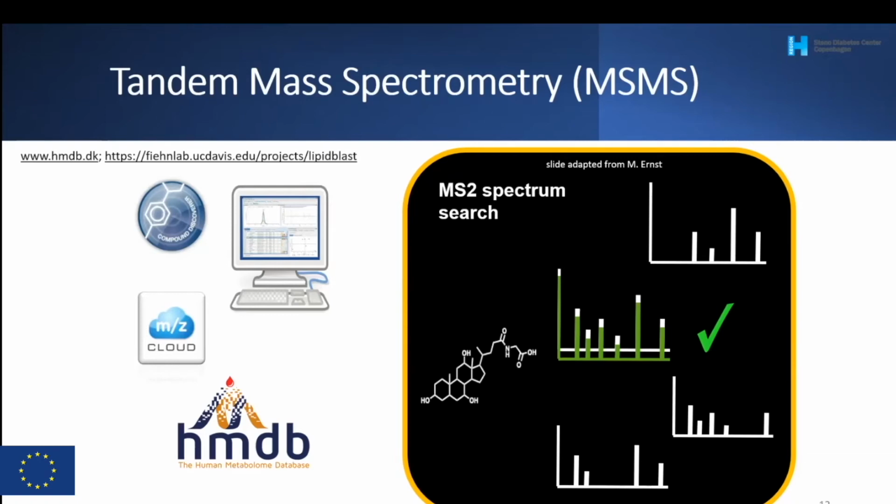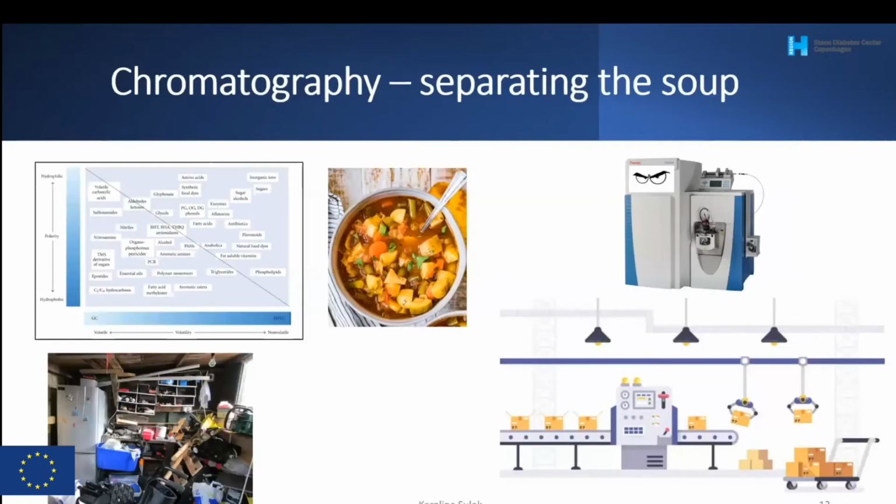This is how you identify, and you have to understand that in untargeted metabolomics it takes quite a bit of time and quite a lot of resources to do this kind of analysis. Still keep in mind that when you get to your raw data, there will be from 1,000 to a few thousand what we call molecular features, the unknowns, and perhaps 5 to 10% identified ones. And why? Because a lot of them we still don't know. There are a lot of possibilities for discoveries, which I think is so fascinating about untargeted metabolomics.